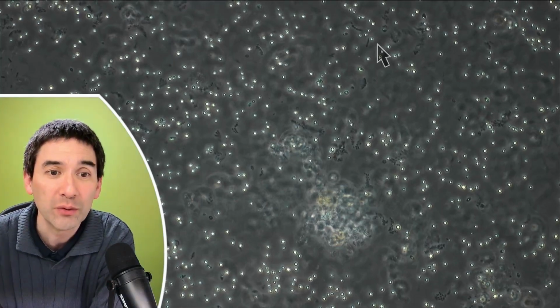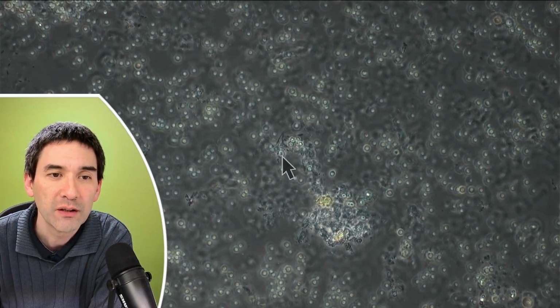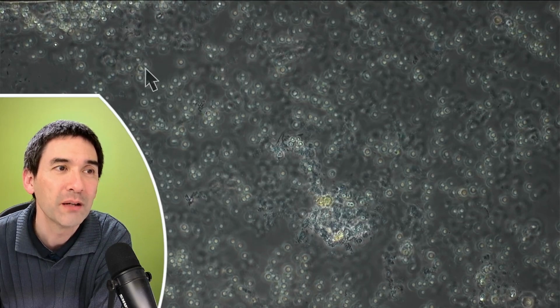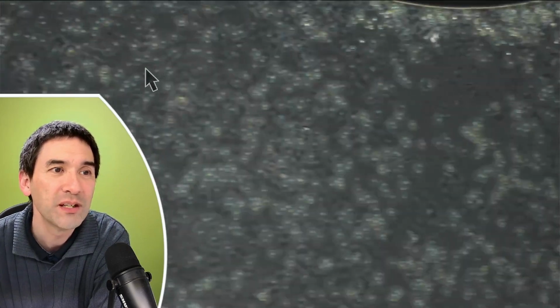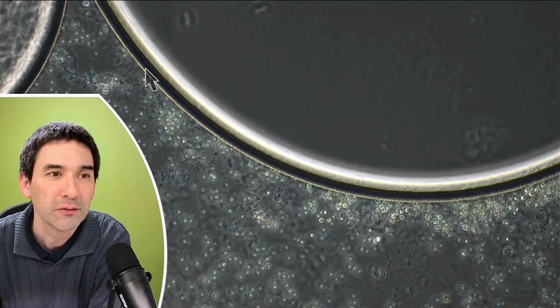However, that's not the only thing that you see here. If you look, and let me refocus, some of the cells seem to behave a little bit differently, especially if you look over here. They seem to be moving a little bit on their own, right? Oh, over here, this one here in the corner. You see this one here? I'm going to recenter this. Here we go. That's a gigantic air bubble that you see up here, right?